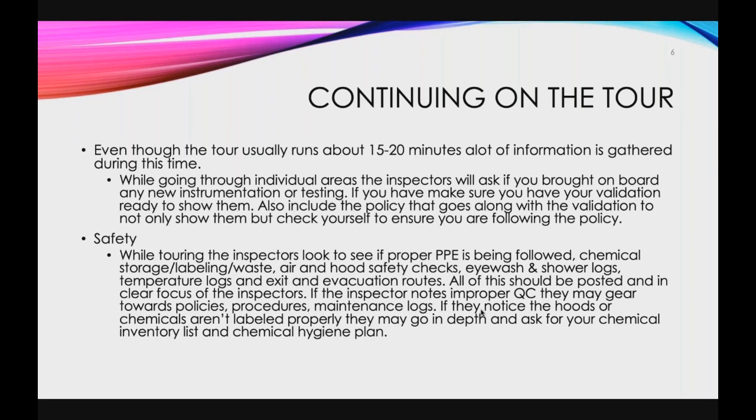Something else on the tour is safety. So while touring, the inspectors look to see if proper PPE is being followed, chemical storage, the labeling, the waste. Where is it? Is everything capped correctly? Is there enough space where it's sitting in a tub so that if there's a leak in the carboy or anything, where is that going? All of that they look at, and you'll see them. Sometimes they jot notes, sometimes they just know what to eyeball. It also depends on the inspector.